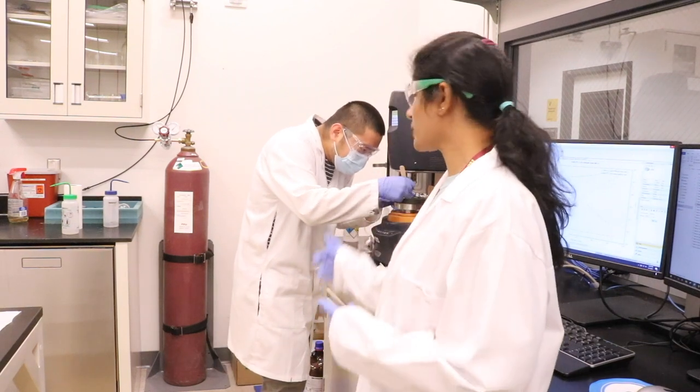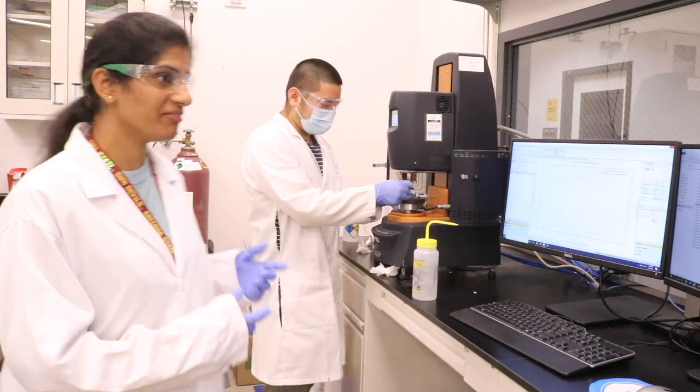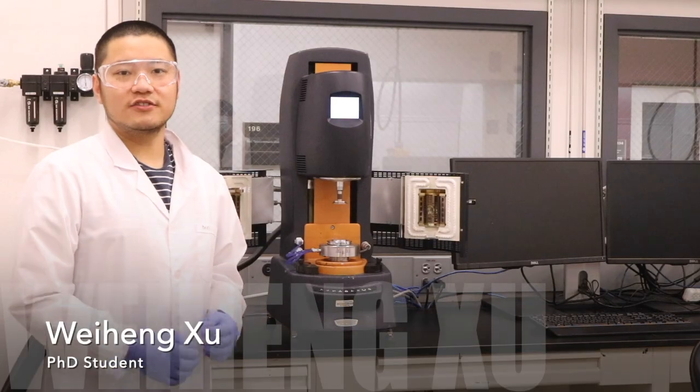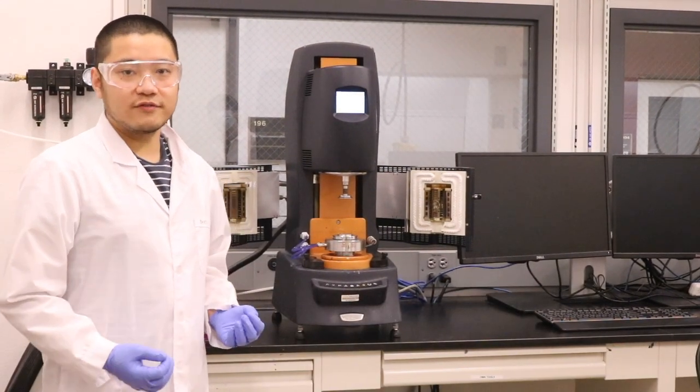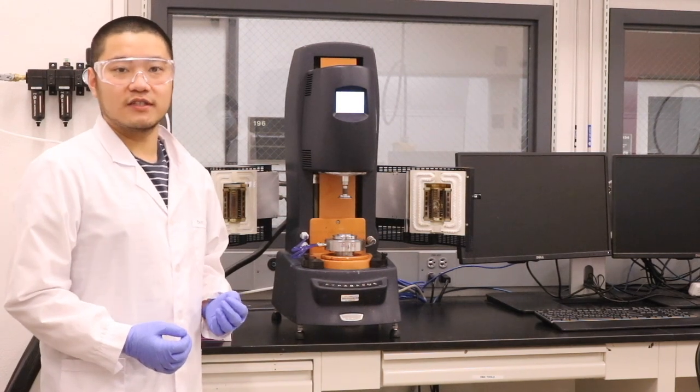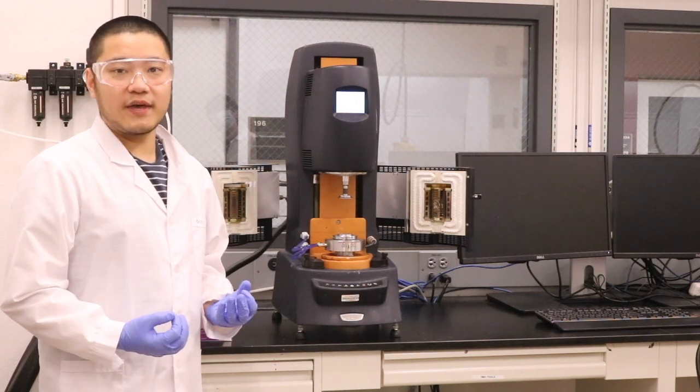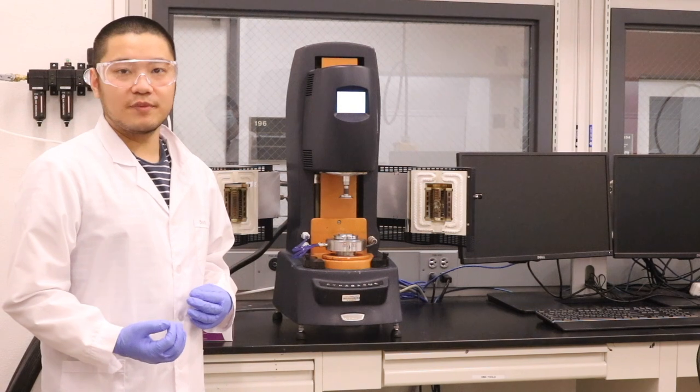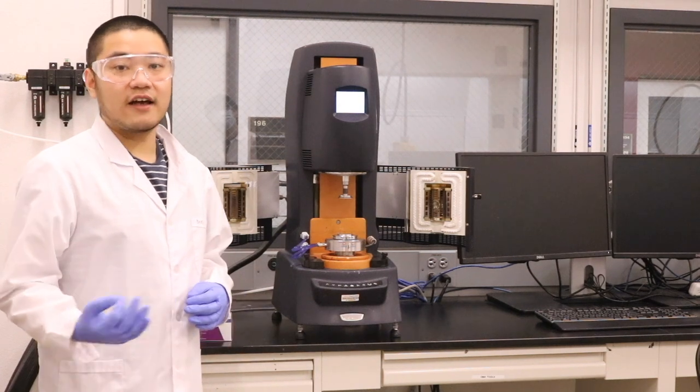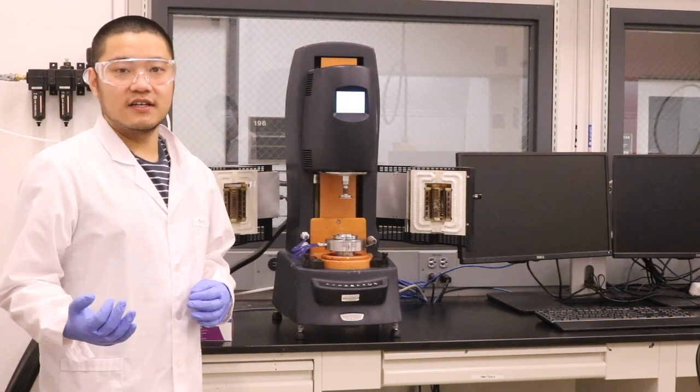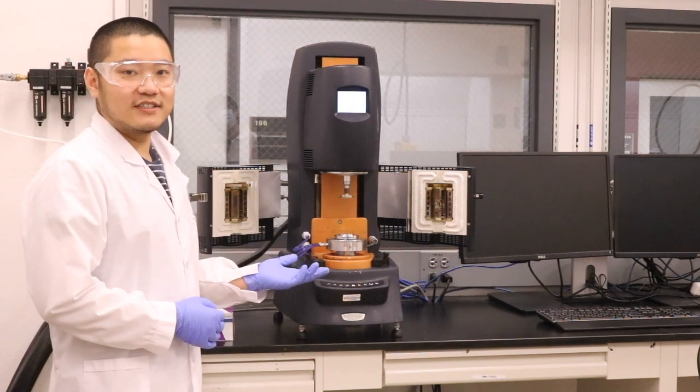As you can see, one of my colleagues is working on a complicated instrument called a rheometer. Rheology is used to describe and assess the deformation and flow behavior of materials. Fluids flow at different speeds and solids can be deformed to a certain extent. Oil, honey, shampoo and hand cream all behave differently in terms of their physical behavior. They can be put in an order, on one side is liquid and on the other side is highly viscous semi-solid substances.